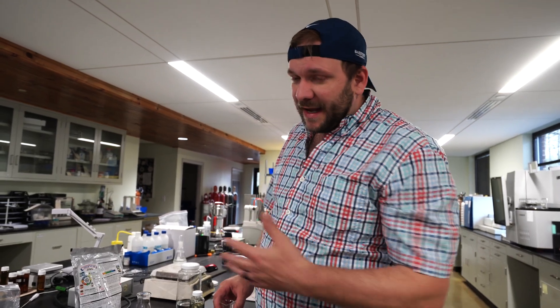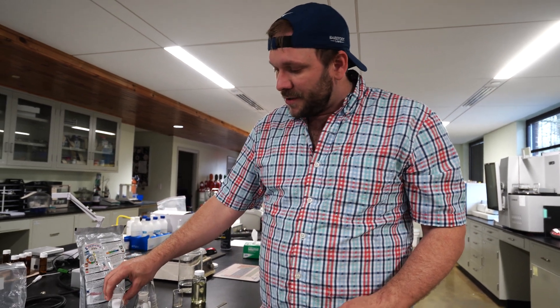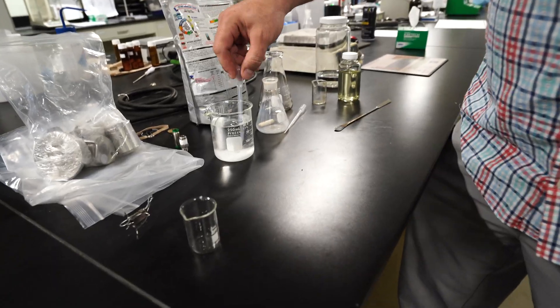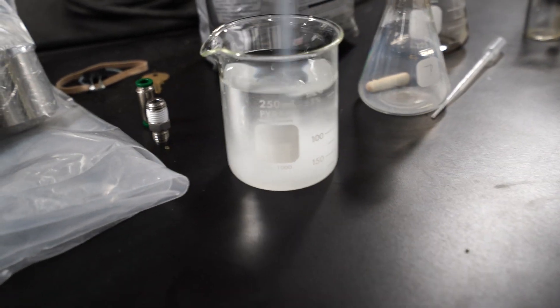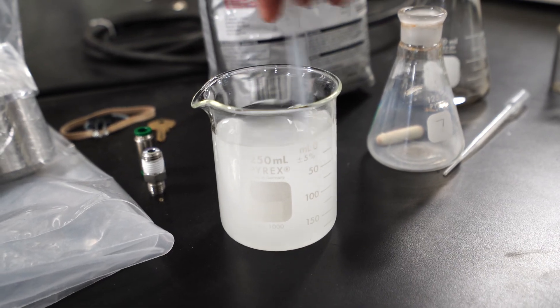Due to popular demand, Magi-Cal was requested. So we're going to repeat our previous backward titration lime experiment that we did with Sawyer Cal and traditional lime - we'll repeat the same thing with the Magi-Cal product. We're going to begin by preparing a one molar solution of sodium hydroxide as our backward titration solution. This is what we will drip into the solution of hydrochloric acid and Magi-Cal.